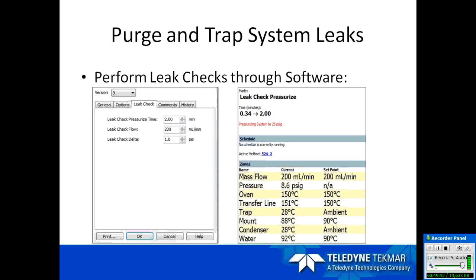And that enables us, for those that have the TechLink software and a mass flow controller, to get a readback of what the pressures are during purge and during bake. What we're looking for is to make sure that those pressures stay consistent from run to run. If you have a purge pressure of, say, around 7 psi, 8 psi, and all of a sudden that pressure is beginning to increase, that could indicate that there's something going on there. It's the same thing with the bake pressure. So all of these things are now recorded in a history log that makes troubleshooting a lot more easy and user-friendly.